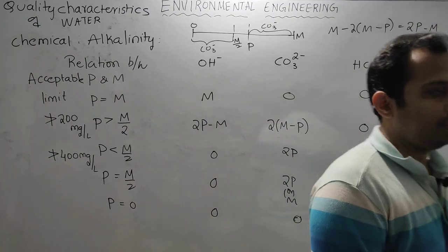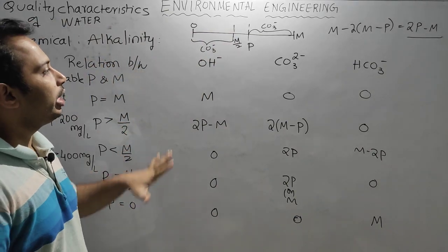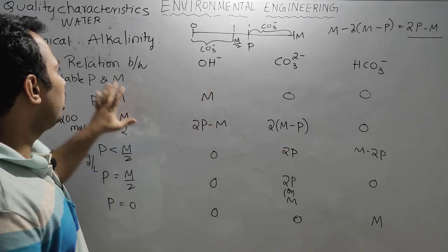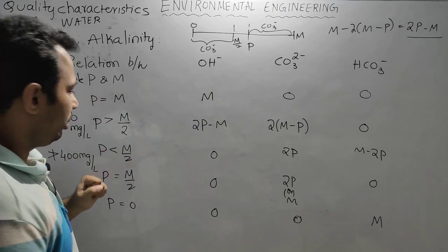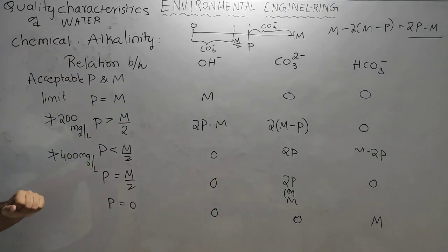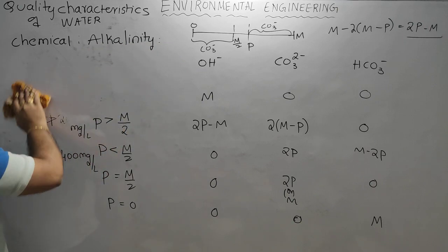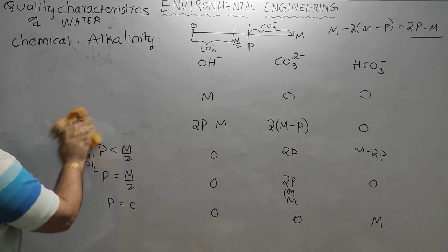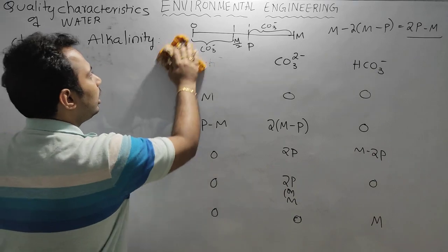In the previous session we discussed alkalinity, how to measure it using the titration technique, and the relationships between the different kinds of alkalinity upon variation in the quantity of titrant with the phenolphthalein and methyl orange indicators, in different ranges of titrant. I told you that caustic alkalinity is negligible for drinking water, and that I will explain it theoretically now.